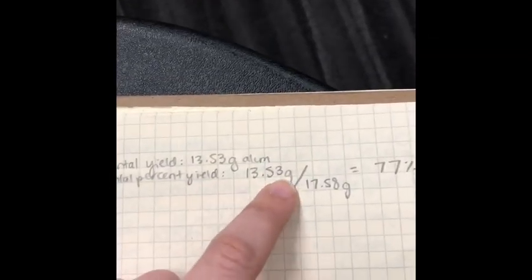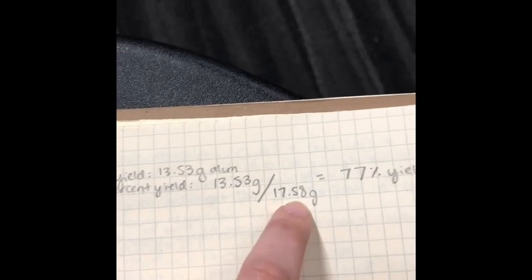Our experimental yield was 13.53 grams of alum, so our experimental percent yield was 13.53 grams divided by 17.58 grams to get 77%. Our percent yield was not 100%, and there are a couple of reasons this could be the case. One may be that during the fourth reaction while producing the alum, when we put the solution in the ice bath, we did not leave the solution in the ice bath long enough for it to precipitate all of the alum that we were expecting. And we'll have to check in next week and see where the crystals are at that point.